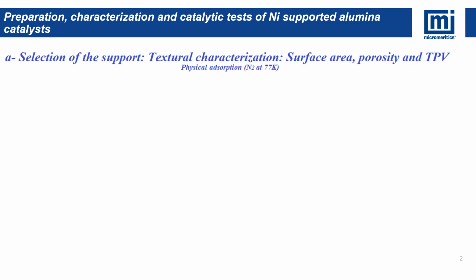Well, before I go forward, as for surface area, we have to make sure that we understand that we have two types of surface area on the support. The external surface area, which is outside of the pores, makes a small contribution to the total surface area of the support, maybe 1, 5, or 10 square meters per gram. While the surface area inside the pores makes a large contribution to the total surface area, and this could be 100, 300, 500 square meters per gram.